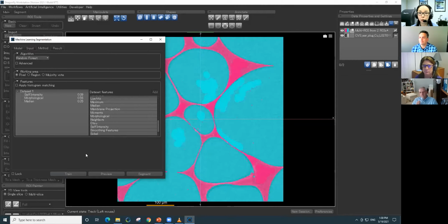Is it easier to show, Mike, if I had a thickness mesh or something in the view? That's right, Aya. If you right click on the mesh in your properties and settings, then you'll see a menu of mesh options, and one of them is to decimate the mesh, and that'll pull up the dialog. You can key in the parameters for your mesh decimation. Okay. We will have another one of those meshes as a result in the process in the workshop today. So when we have that, we can take a look at that.